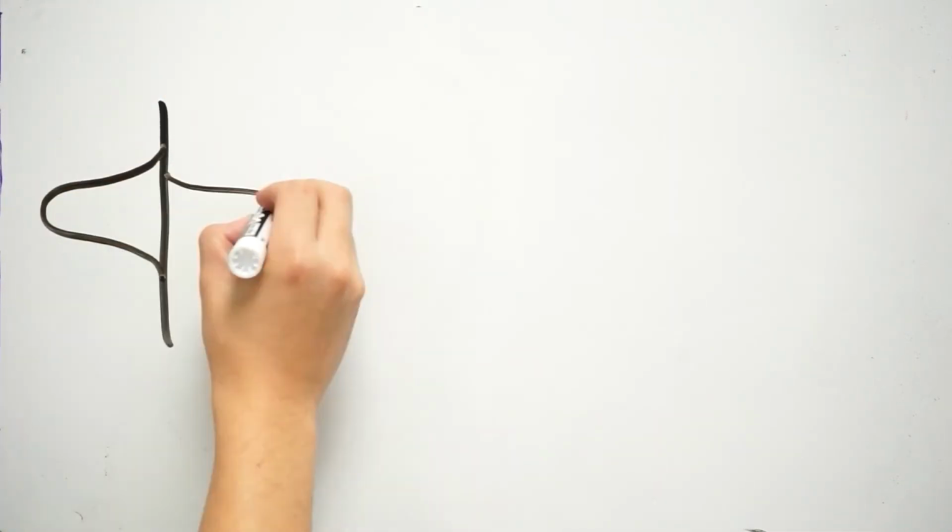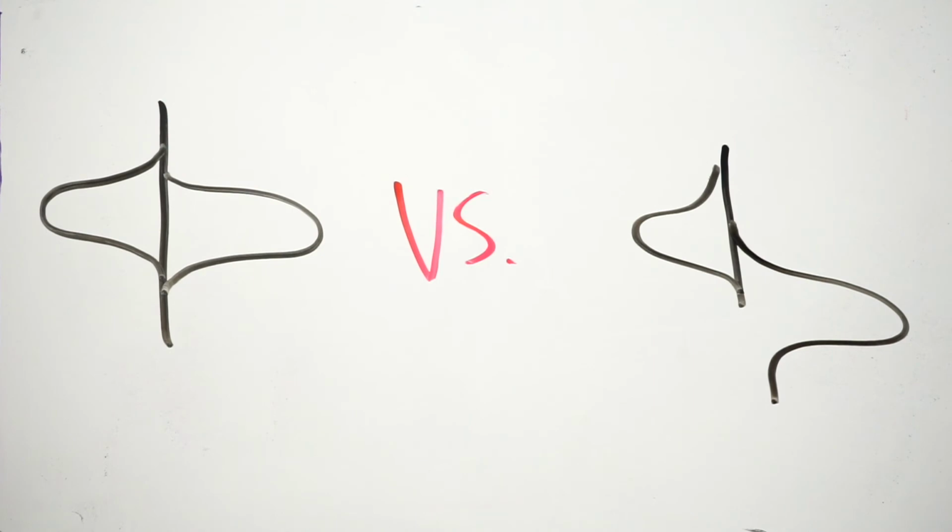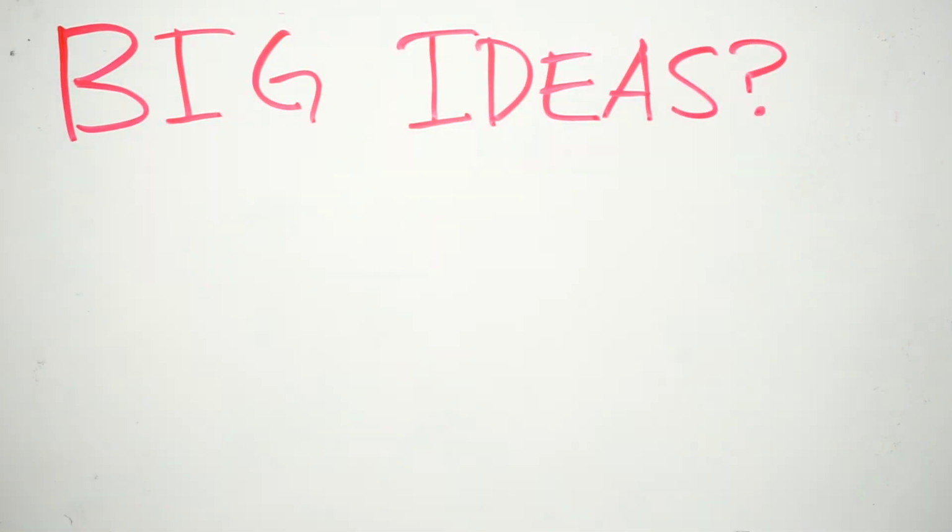Here, the extent to which broadening occurs will depend a lot on how well the particular analyte can diffuse out of the stationary phase. The longer it takes, the wider the section of analyte that will diffuse out, and the broader the peak will end up being. This will occur if the stationary phase is really thick and it just takes more time to travel up and out, or if the diffusion coefficient is really small, indicating that the analyte innately has a lot of difficulty diffusing out. While it's good to understand mass transfer in its entirety like this, it's not necessarily required in practice.